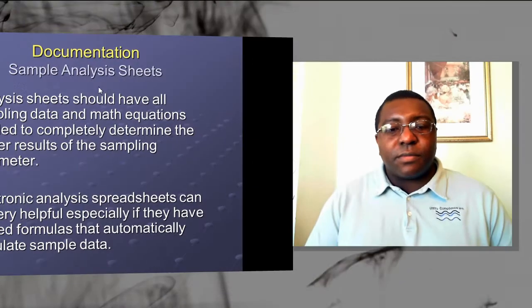You may want to say raw sample A, B, C, or give it a series of numbers that can indicate your time, where it could be raw sample 0700, 0710, 0720, or something like that, as a unique identifier. So when you need to track that sample, you don't get it mixed up with something else.